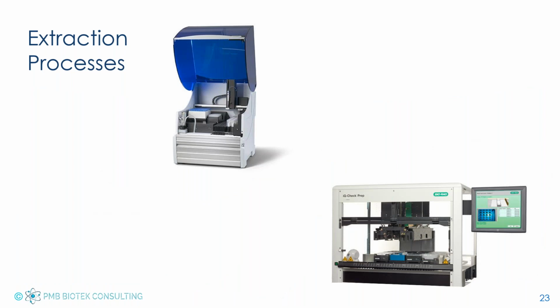All right, so thinking beyond the enrichment protocol, what we want to recommend to labs is to start to review the extraction processes you're using. So can you automate it? When you start to automate extraction processes, not only do you save time from a labor and efficiency standpoint, but they're more uniform. So you're going to reduce transferring particulate from one sample to the next. You're going to have more uniform reaction volumes in all of your samples. You eliminate that human error from it. There is more capital investment that's required up front, but it's minimal when compared to a chemistry capital equipment investment.